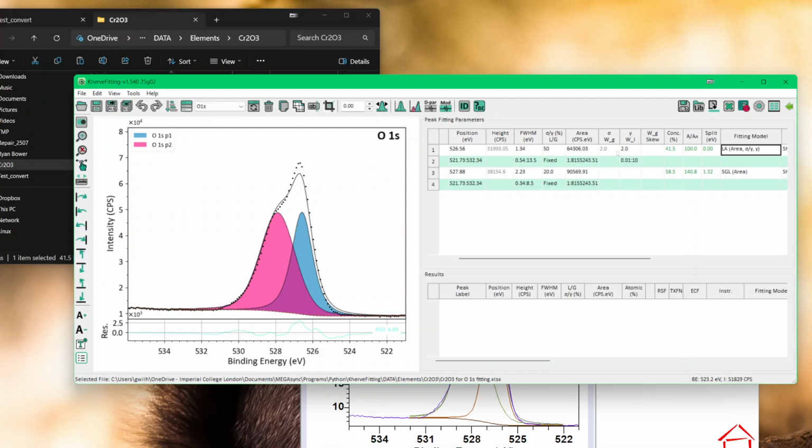And an LA50 is actually a 2 in the gamma, because you have to make it more and more to change the power, and that's done using those types. So that's done with a 2, and then a standard, yes, it's done with a 2 power. So it's an LA of the power 2. And then the SGL is done at 20%. So it's almost a good like for like.